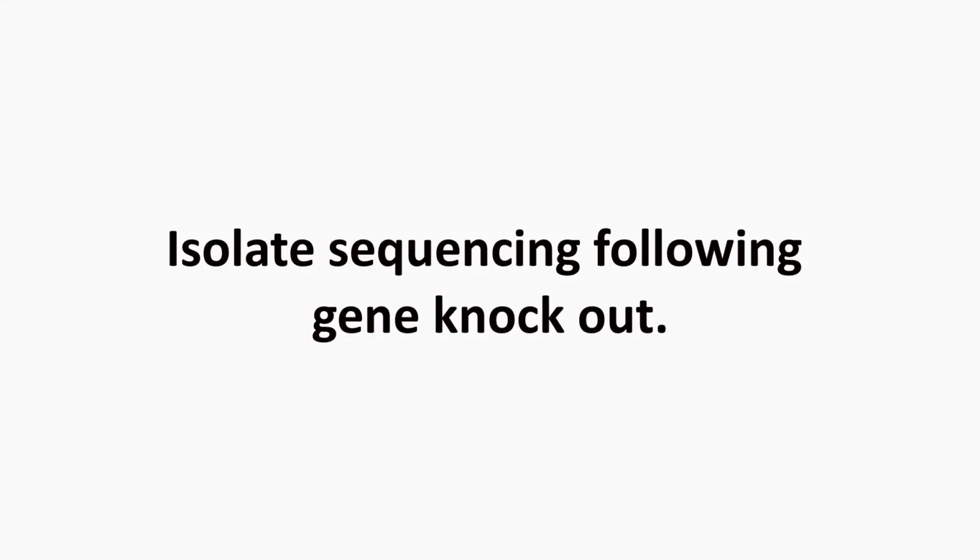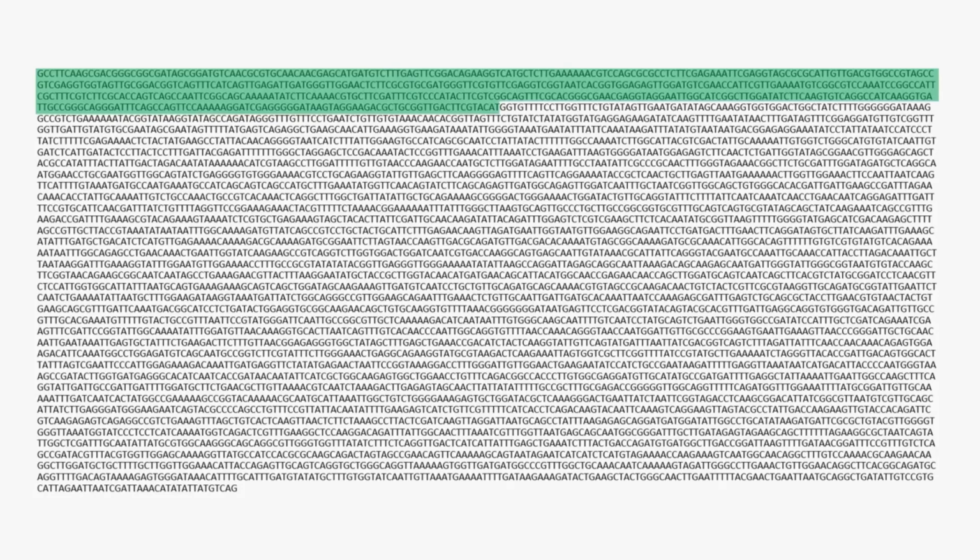This next part of the video will look at the sequence data. The following is a recap from video 1. There are 3 coding sequences predicted. To help distinguish them, these have been highlighted in different colors.